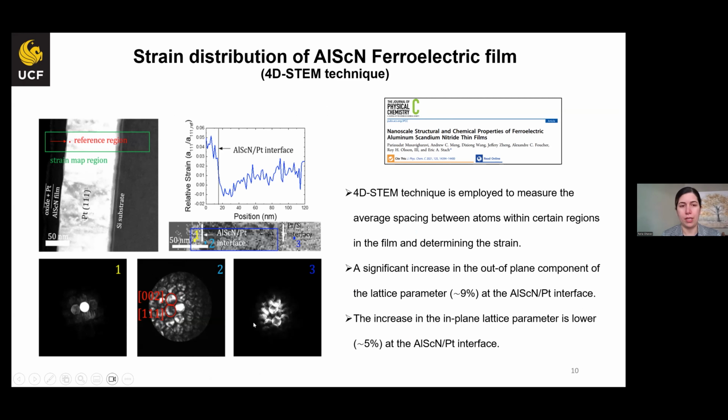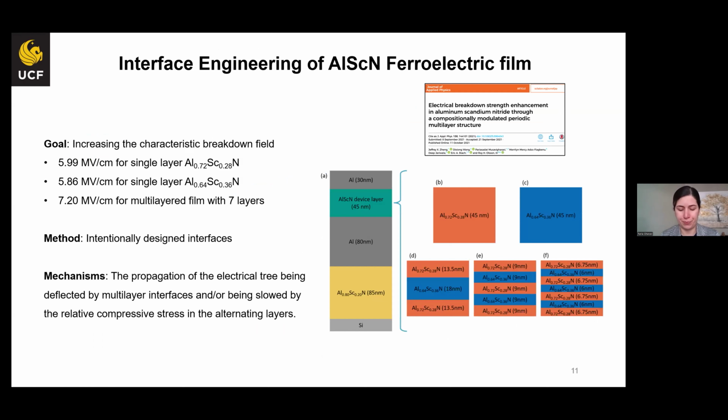So as you can see, the same sample, the same film on the same substrate. Now using 4D STEM, we could measure the d-spacing, the distance between atomic planes of the thin films, with a reference area that we have in a PT template and the bottom layer, so the reference area can be different. And what is very interesting to see is a significant increase of out-of-plane lattice parameter, which is around 9%, and also a significant increase of in-plane lattice parameter, which is around 5%. So this helps us to understand that it's very easy and very accurate to measure the strain using 4D STEM.